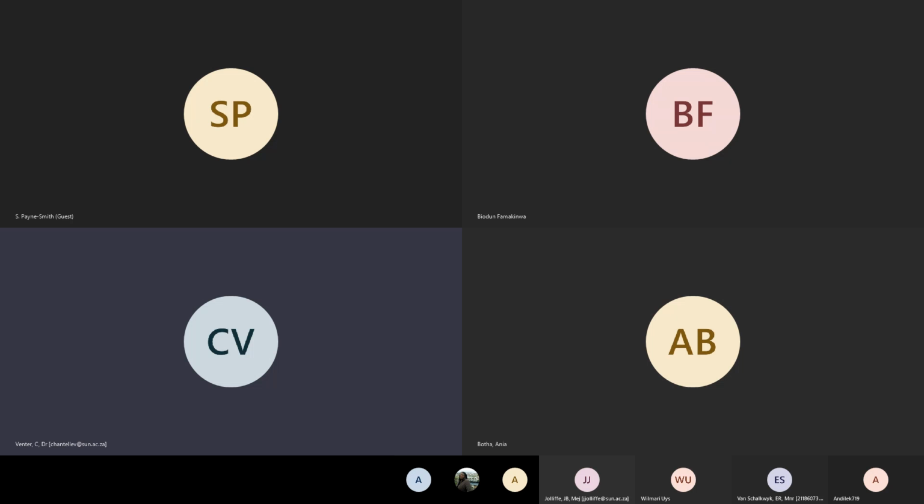So remember that the main thing that you want to do with sample preparation is to make sure that at the end of the day, when you view your sample under the microscope, it looks as close as possible to its native state. Meaning, if you were able to take your sample and put it directly under the microscope, does it look the same? That's what you want to see after you've gone through the wax embedding or any sample preparation. So you don't want to distort structures or break them or damage them. So that's the most important thing.